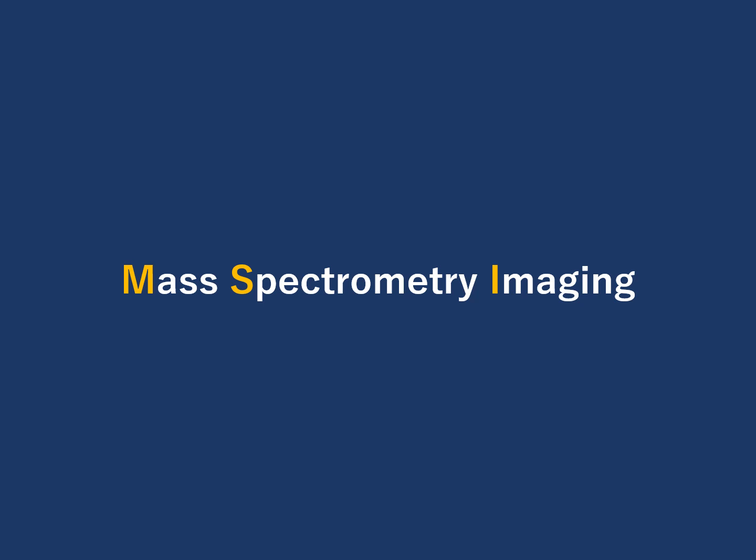Let me introduce the MSI team, one of the research teams in Fukusaki Laboratory. MSI stands for Mass Spectrometry Imaging. This video introduces the outline of mass spectrometry imaging and research results in Fukusaki Laboratory.